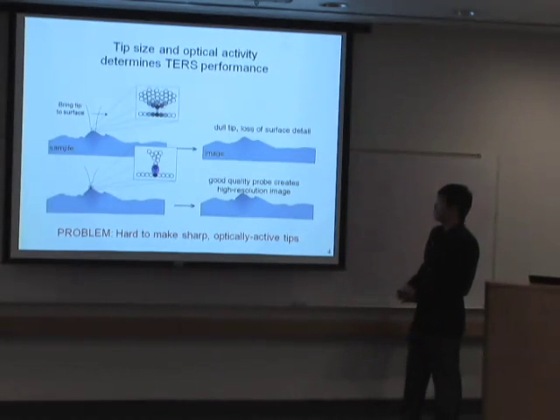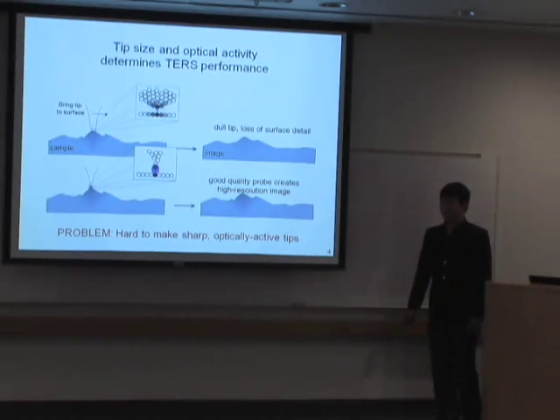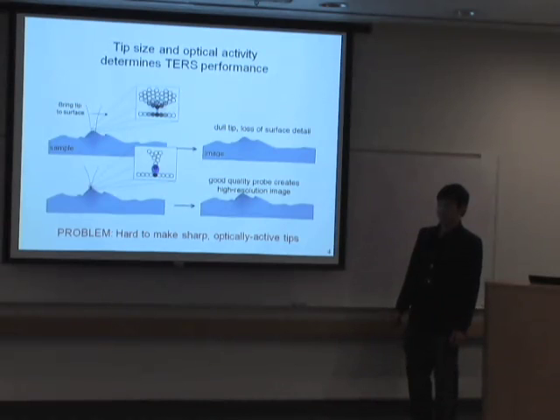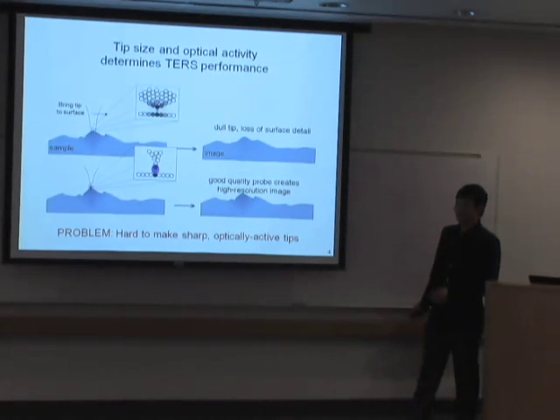Well, if you have a sharp tip every time, then it's going to be easy to get a good resolution, but it's not that easy to get those sharp tips. And with a sharp tip, you could get resolution down to nanometer scales. So is it a twofold problem, that we want A, sharp tips to get nanometer scale, but B, the reproducibility is difficult? Yes. Well, it's really one thing, because you really want the sharp tips, but it's hard to make them.